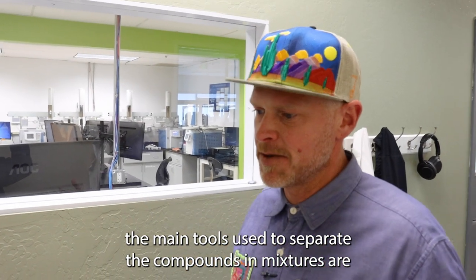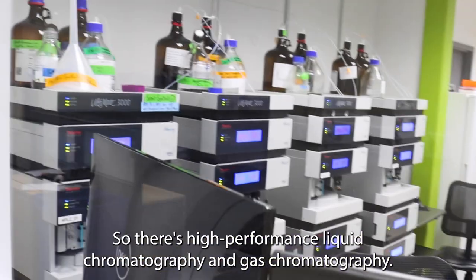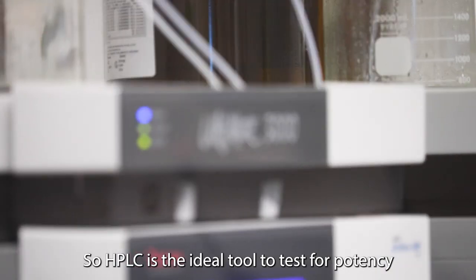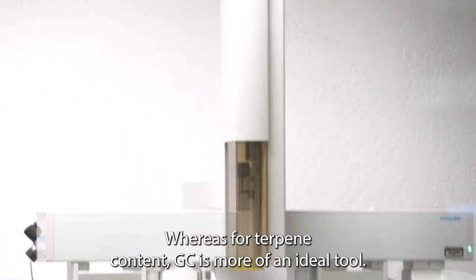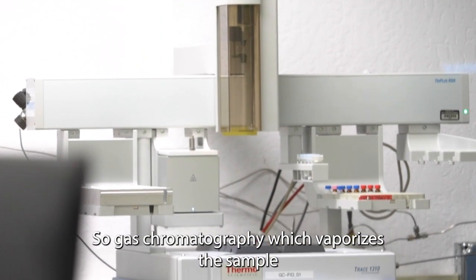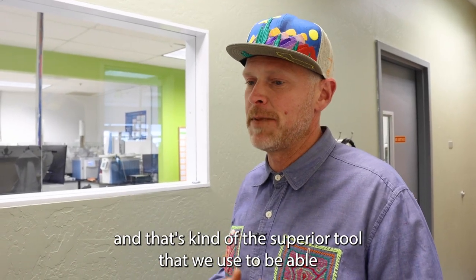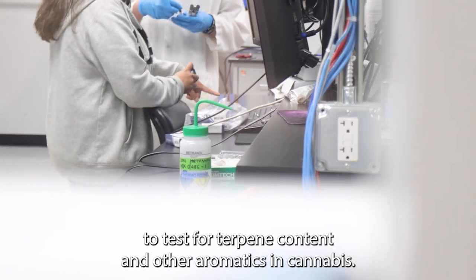The main tools used to separate compounds and mixtures are chromatography instruments — high-performance liquid chromatography and gas chromatography. HPLC is the ideal tool to test for potency, whereas for terpene content GC is more ideal. Gas chromatography vaporizes a sample and is the superior tool we use to test for terpene content and other aromatics in cannabis.